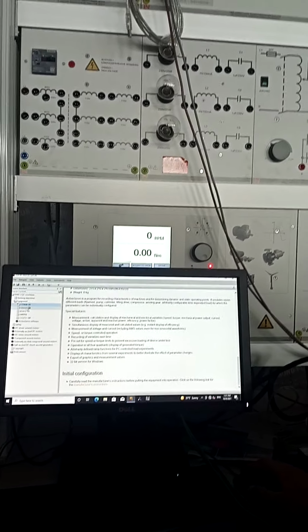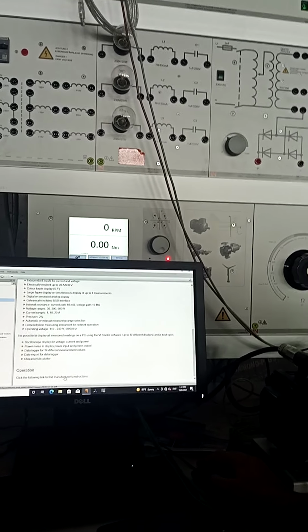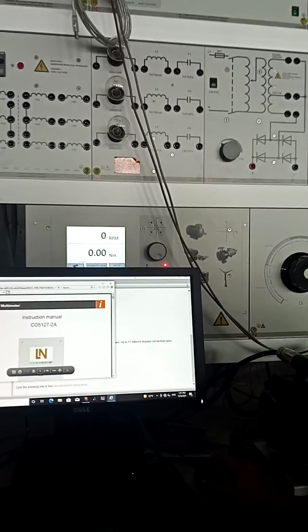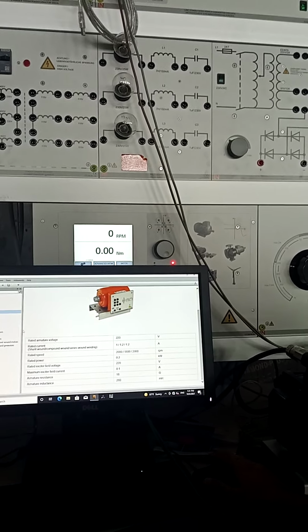Okay, then next is this one. Everything I said, similarly, you can download here. You can click, then you have the next one. Next is about the machine.